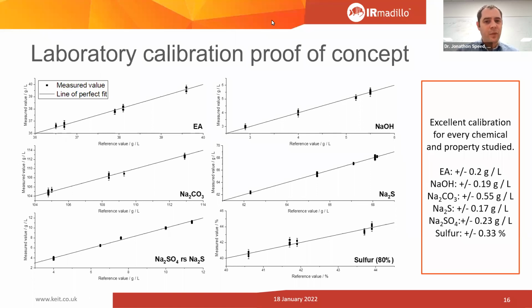It's the kind of thing that might be worth doing a proof of concept on in the laboratory, if that would be possible. Pitch obviously has a very different spectrum to a lot of the things we want to look at, because it's mostly hydrocarbons. Talc is quite different, again, in a different way. So spectrally, we would be able to differentiate between them, but I don't know if the particle size would allow us to see it.